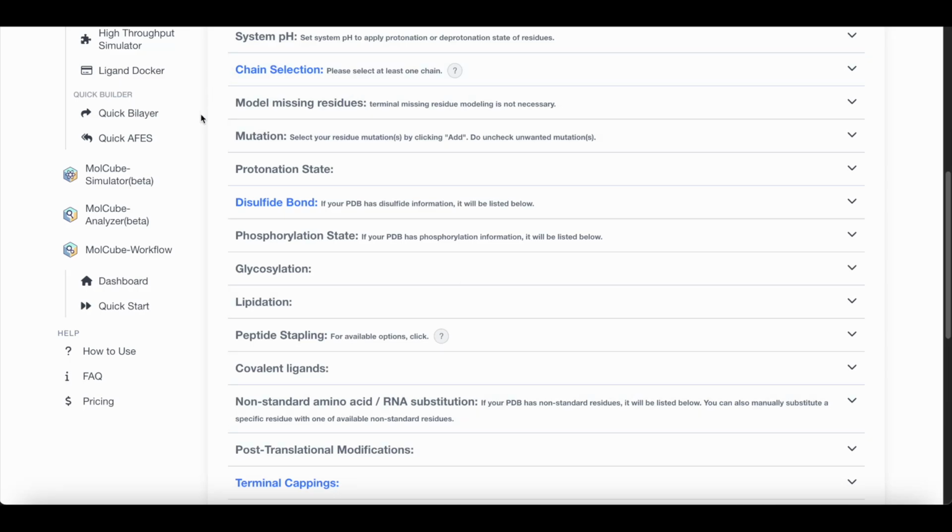We have already demonstrated the basic usage of the PDB Reader in a previous session. Here we will begin from step 3 to highlight the advanced options. If you need instructions on the basic functions, please refer to the earlier demo first.